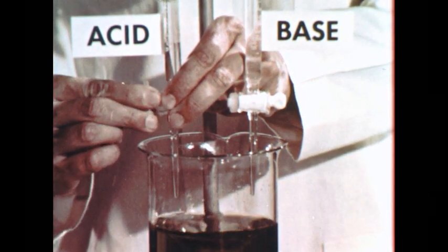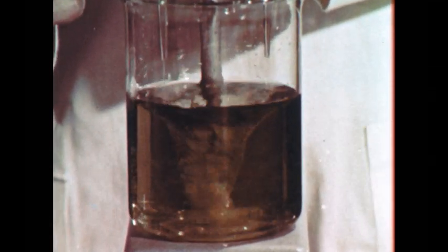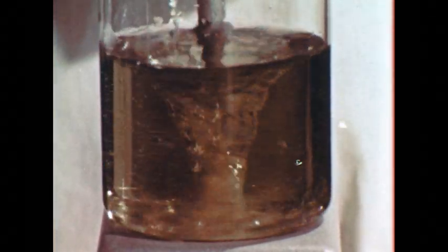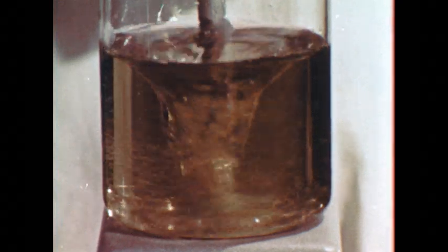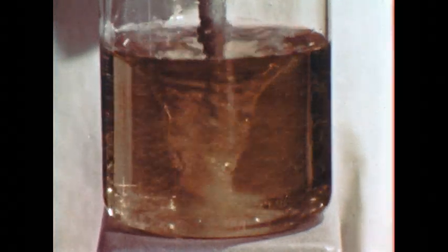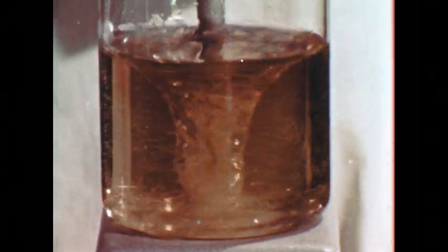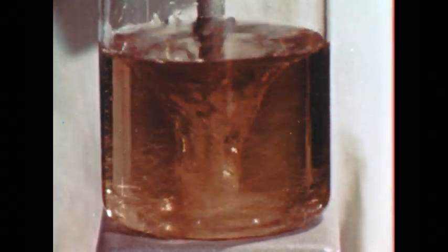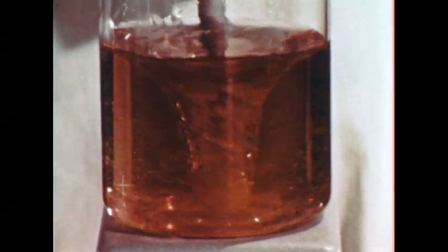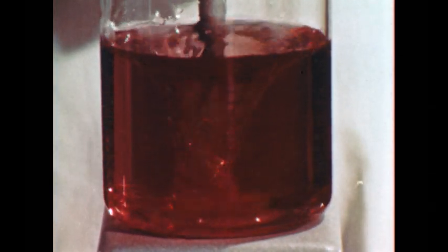From a burette above the beaker, we first add acid. The blue form of the bromothymol blue accepts protons from the added acid and becomes yellow. As we add more acid, the methyl red molecules accept protons, forming red ions. These are mixed with all the other yellow forms and give orange as a total color. Next, with still higher acid, the methyl orange also accepts protons, and the solution turns red. These 4 indicators have, one after another, now accepted protons.